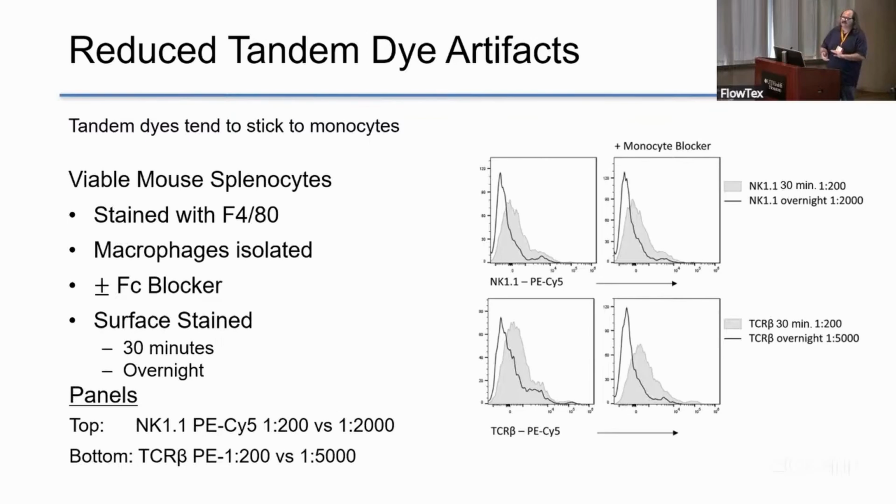Once again, it gets a lot less complicated when you go to unmix your data later on, because you have a much more clean background to start with. And I don't know about you, but I really don't like unmixing errors.